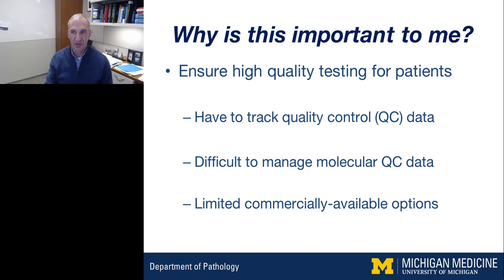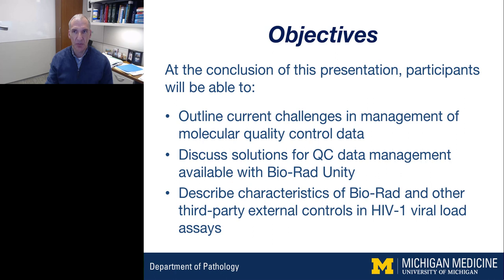It's difficult to manage molecular QC data. It's very time consuming, and the rules that have been utilized in other areas of lab medicine aren't easily applied to molecular diagnostics. Do you use CT values? Do you use log data, for example? And up until now, there really haven't been any commercially available products. And so the approaches that we've taken, and you'll see examples from my lab, have been very manual, homegrown. It's very labor intensive and requires a lot of effort. And so that makes managing QC data very difficult, challenging, and that's why it's important to try to identify solutions to help us with that process.